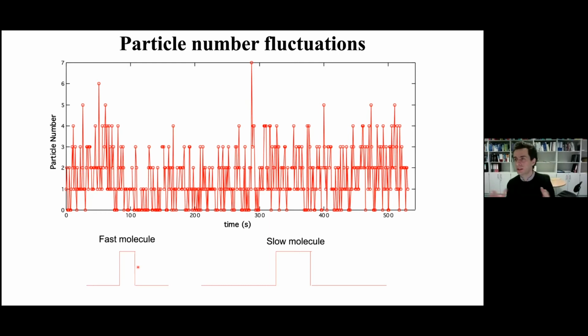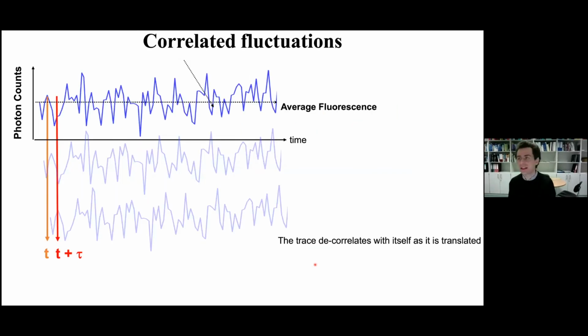If a molecule is slow, or made slow, or intrinsically slow, or the system is very viscous, whatever, then you will see a burst of light which is longer, because the molecule will stay in the excitation volume and therefore will emit fluorescence for a longer time. So a realistic trace, which you will get in a microscope, will more or less look like this. So definitely more noisy, but you will definitely have bursts in signal whenever your molecules cross your excitation volume.